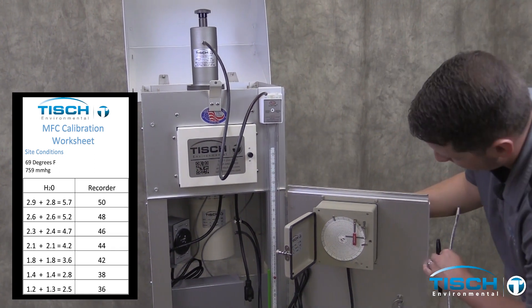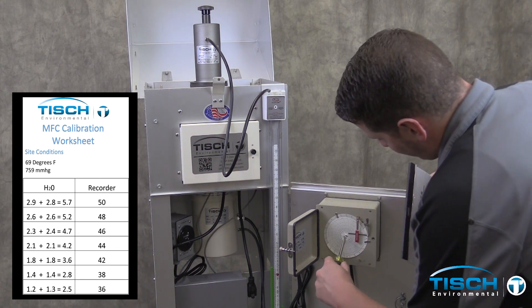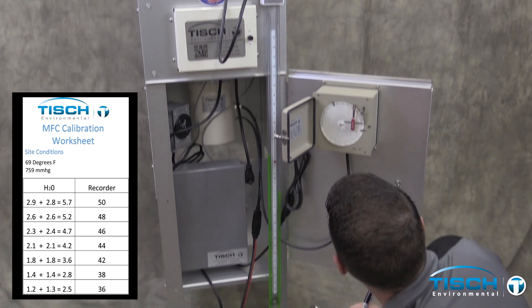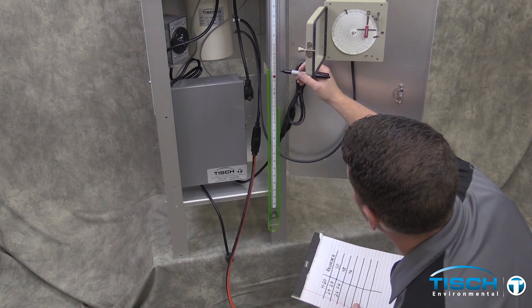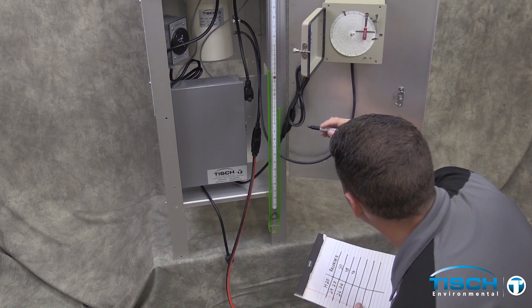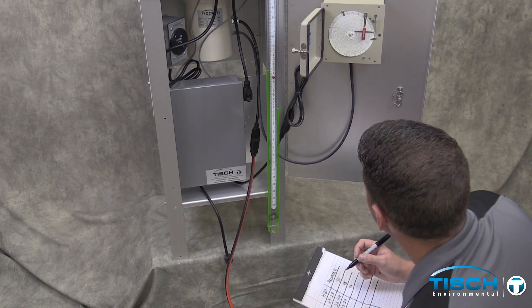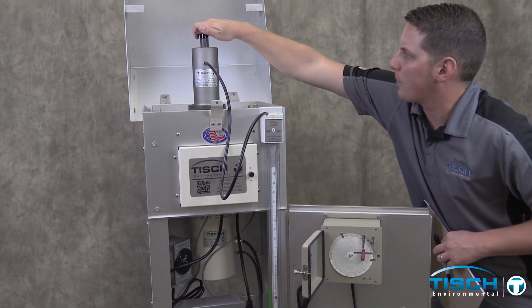Turn the knob again clockwise to get a reading of around 46. The manometer went up 2.3 and down 2.4 for a total of 4.7. We're going to do 7 points. Although you will need a 5-point calibration, we take a few extra points just in case we might need them for the future.